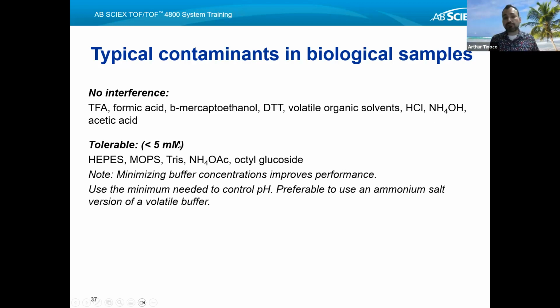If you're going to use a buffer, it must be used at a low concentration, lower than 5 millimolar. Even 5 millimolar is pretty high. So if you're going to use a buffer, my suggestion to you is to use an ammonium-based buffer, so an ammonium salt of a volatile buffer.